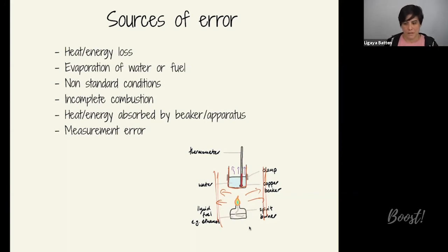So that's another thing to potentially consider. So the main source of error, as usual with all of these enthalpy change experiments, is heat loss, but depending on exactly how the experiment is done and whether it's a combustion experiment or a neutralization or a solution related experiment, you may have other things, for example, like the evaporation of water to think about.